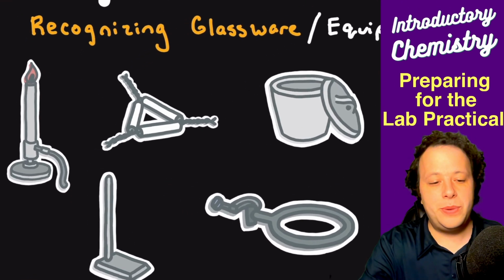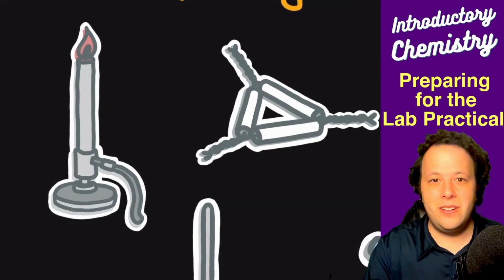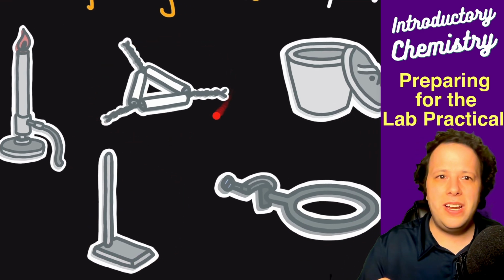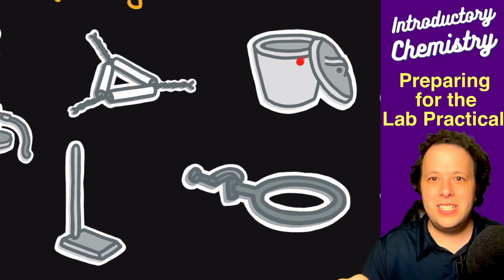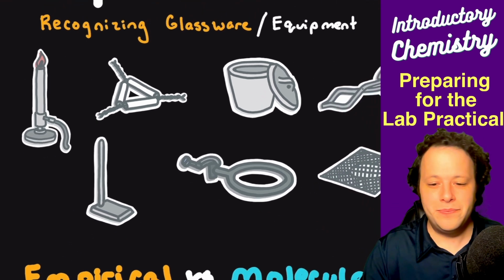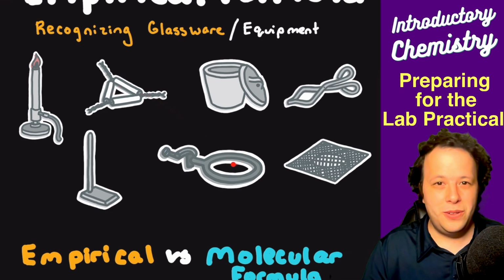So a couple of things that we learned about, right? We learned about the Bunsen burner, so that's on the far left here. That should be familiar. Other things we use a lot, we use ring stands all the time, so you might have to identify that. Clay triangles were used to hold our crucibles. If you remember, the crucible sat on top of the triangle, and then that went on top of the Bunsen burner flame. We also had iron rings that we used as well, so the triangle would sit on the iron ring.